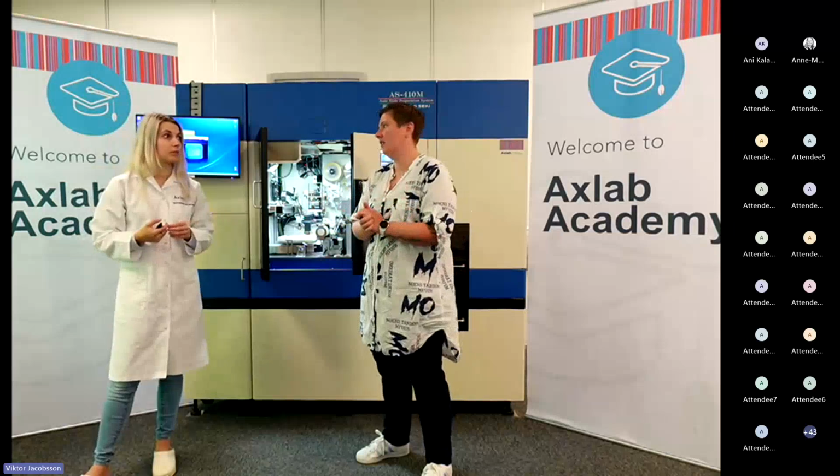I think you're right there, and especially for us, it has really been an eye opener to see the quality above all, and I think our improvement in quality is a big factor in all that. For example, 10 years ago I think we had 10 to 15 technologists doing the manual cutting. If I have a good day in my laboratory, I will have 6 or 7 doing the manual cutting. So again, the task has changed, and maybe even more so in the future. I think so.